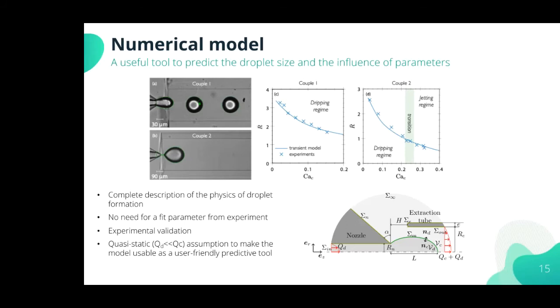The full model was first validated using experiments. As you can see on the image, green lines generated by the model perfectly fit the droplets during and after the formation, and in both couple cases.